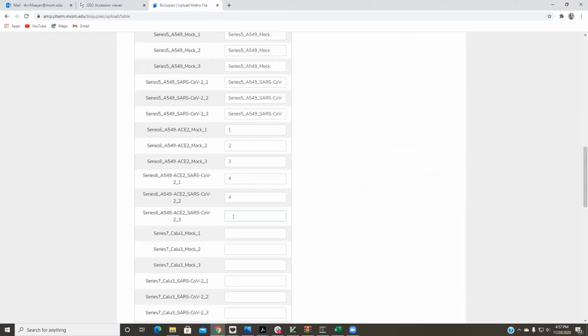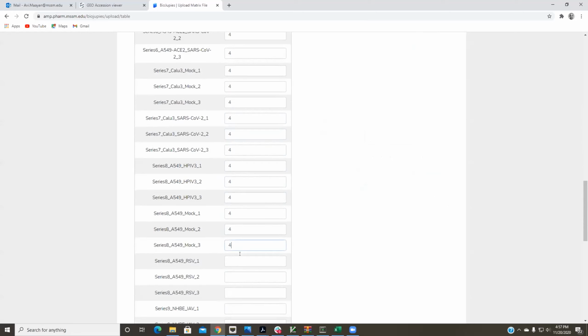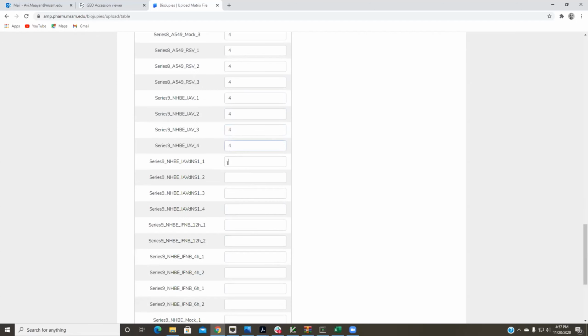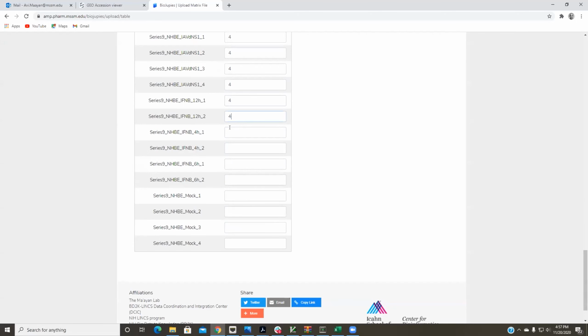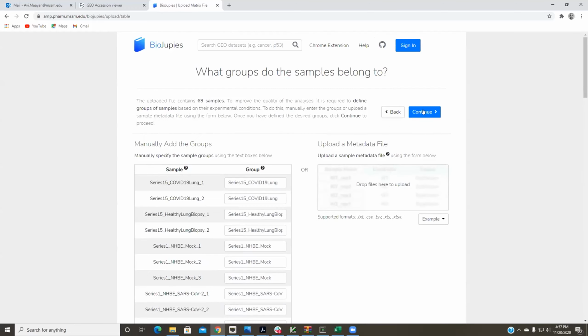I'm just putting it in, so we are going to ignore these samples and just focus on series 5, so I don't waste too much time. But if you are using that option, you have to fill in for everything. So now we have our groups, and then I click continue.